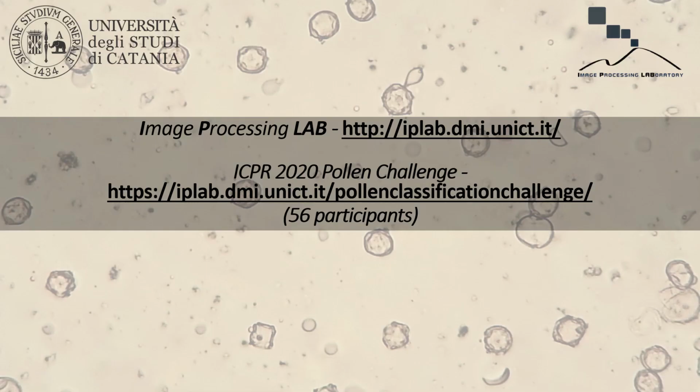We organized a pollen classification challenge, which has been accepted at ICPR 2020. We request participants to perform the object classification by using our proposed dataset.